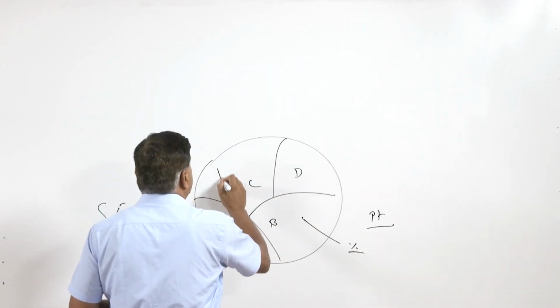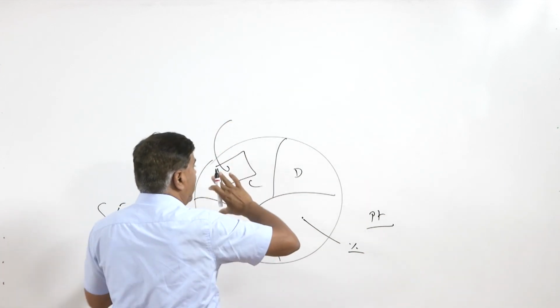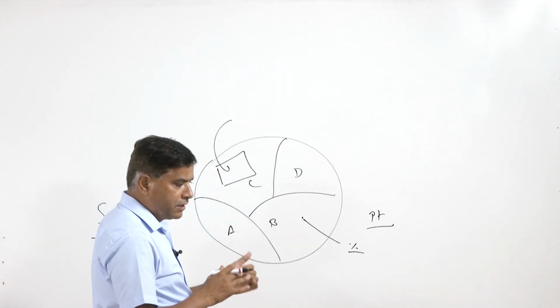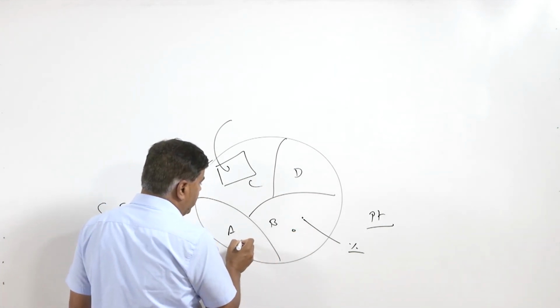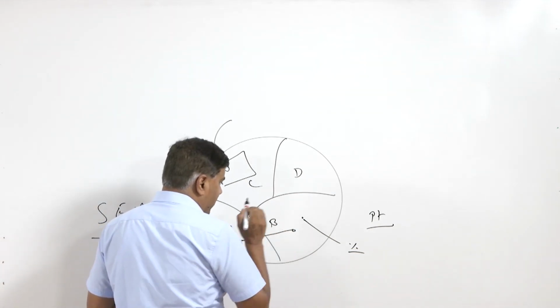But if we need a better representative zone of the area being analyzed, we can select a particular area like this, and it will be analyzed for area analysis. And if we want to see the variation in composition from one zone to another, we can draw one line between 2 points of our choice, like this.